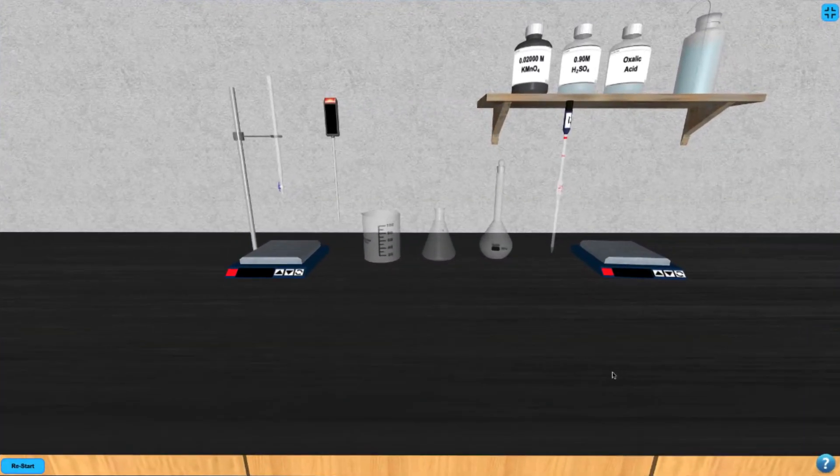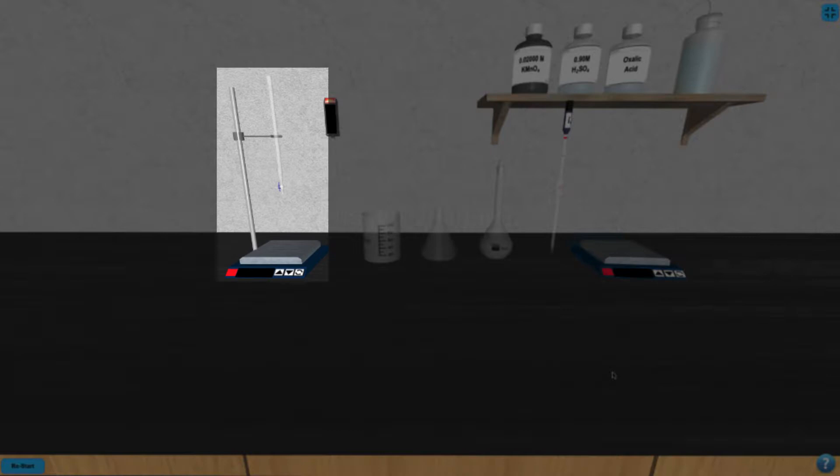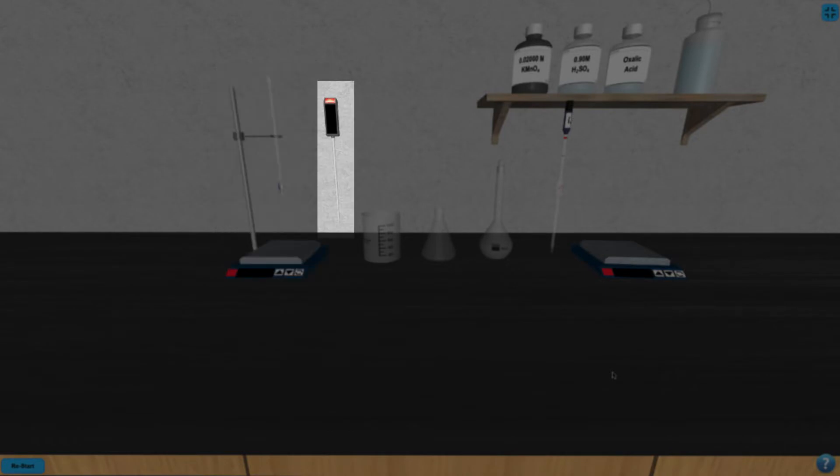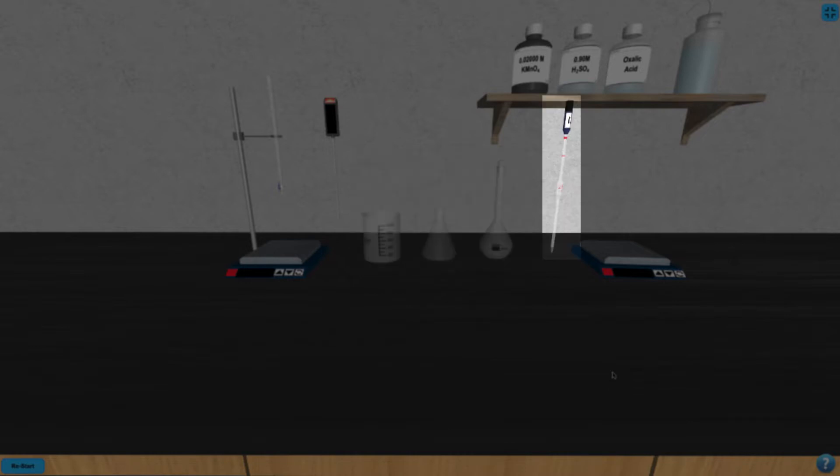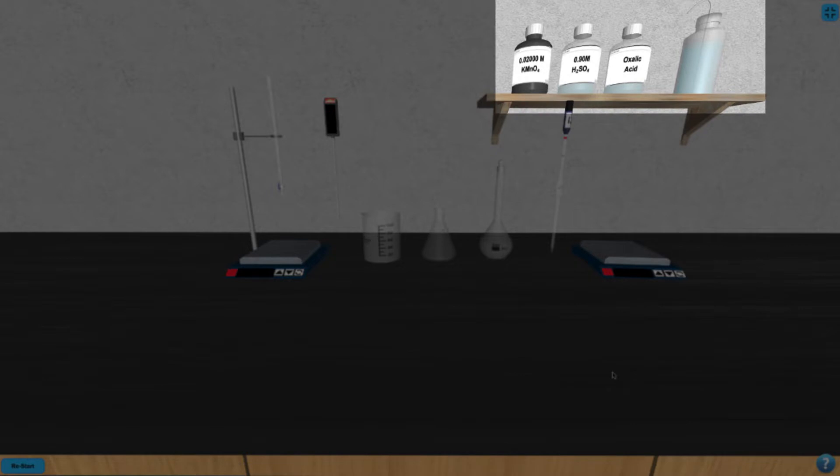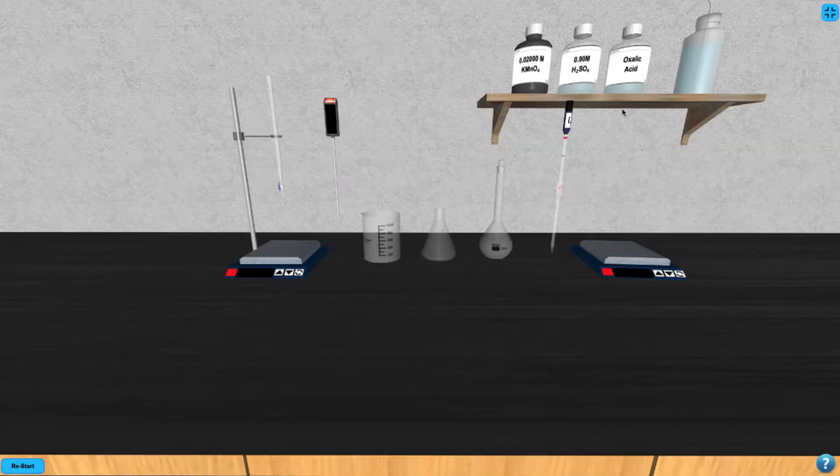In this simulation, we have a burette over a stir plate, a digital thermometer, a 100 ml beaker, Erlenmeyer flask, and volumetric flask, a pipette, a hot plate, and various samples to work with.